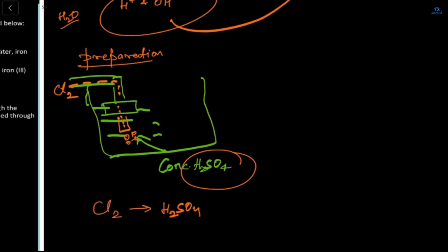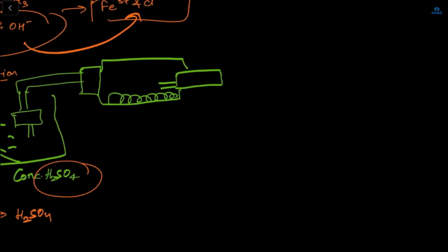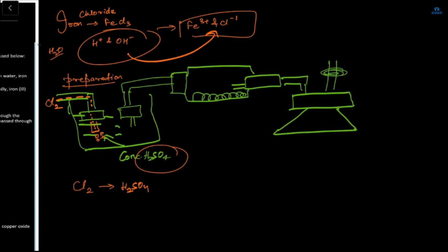Now again this thing. First let me make the diagram. Like this. Do you know what this is? The spring type thing? No, ma'am. Okay, now this whole thing is the preparation. Now see here, we took one container, and in this container there's pure concentrated H2SO4, and here chlorine is taken from outside as a supply.